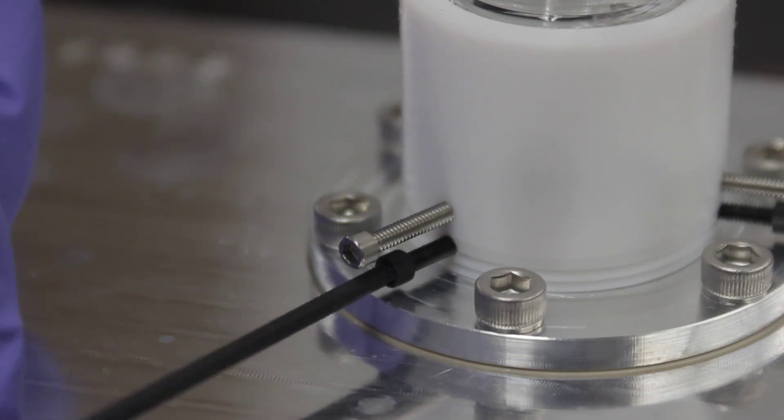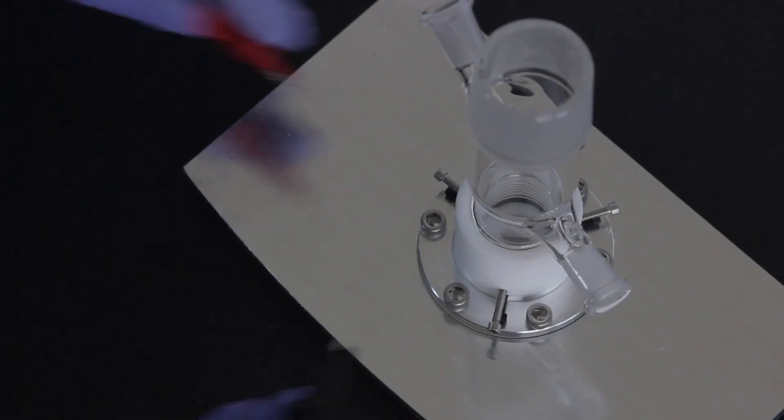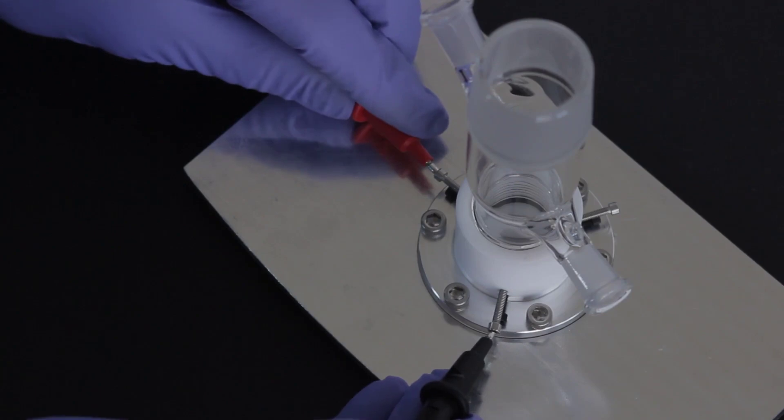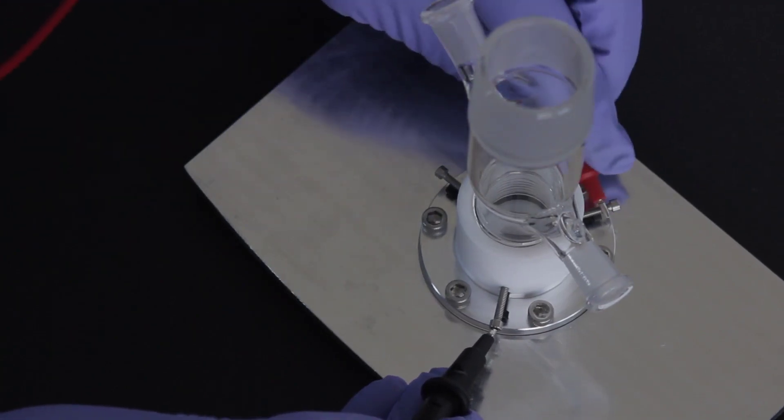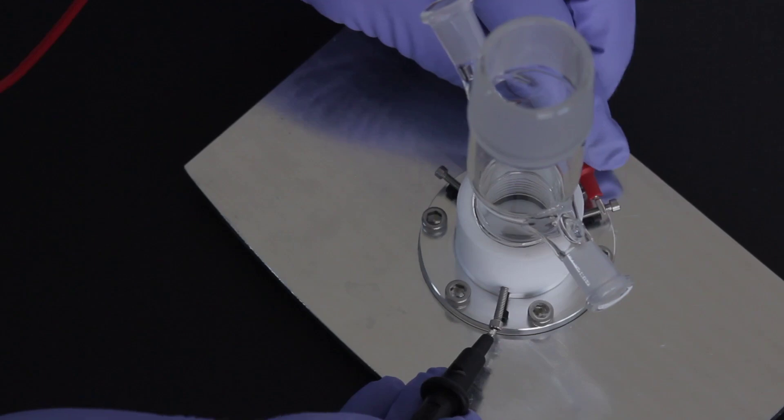Loosen the nylon pin retaining screws to allow the pins to extend and make contact with the working electrode. It's a good idea to test the electrical contact at this point by measuring the resistance between two stainless steel screws.